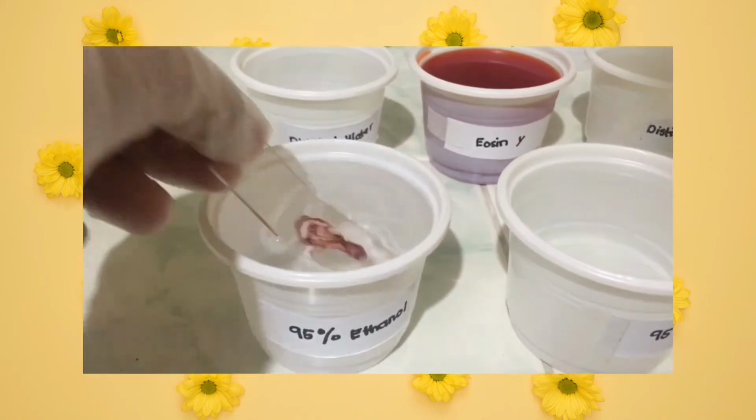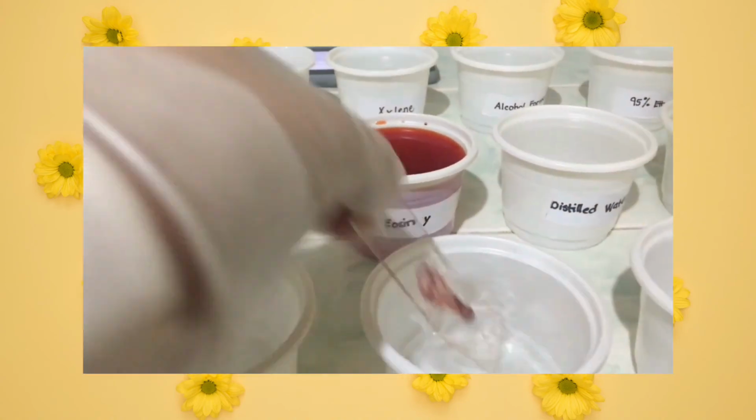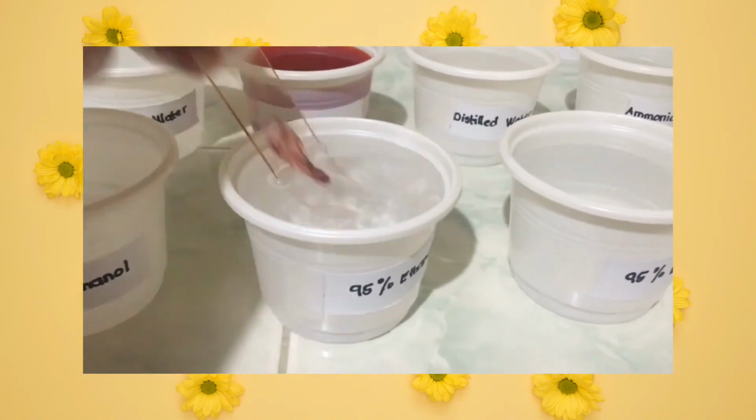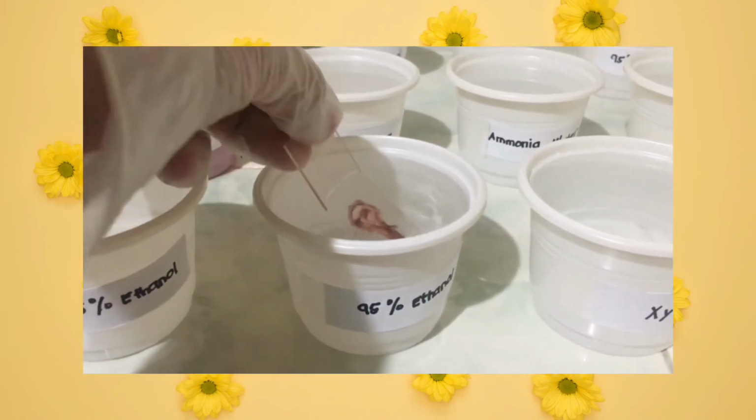And for the step 9, dip the slides in a 95% ethanol. And again, there will be 3 changes of dipping with the same reagent. Each must be submerged 10 times.